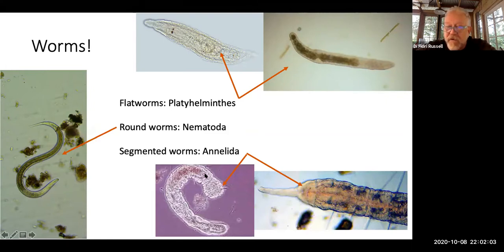And for many of the annelid worms, you can see these little hairs. Notice on this one, it's got these longer hairs. They're called setae, and they're on each segment, typically. Not always, but many of the segments have them. They're not jointed, that is, they have no joints in them, so they're not an arthropod. But they use these little setae sometimes to move through the environment, like little paddles. So they're segmented, they have setae in the segments, and these are annelids.